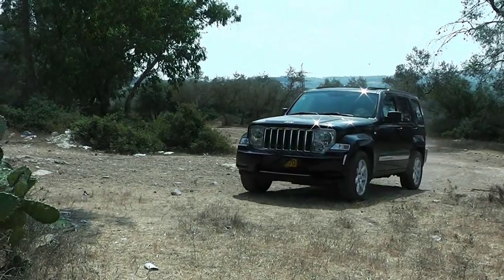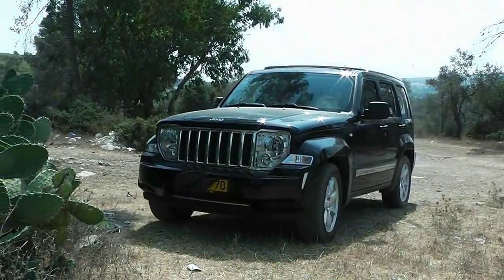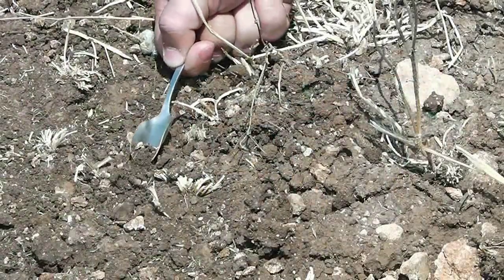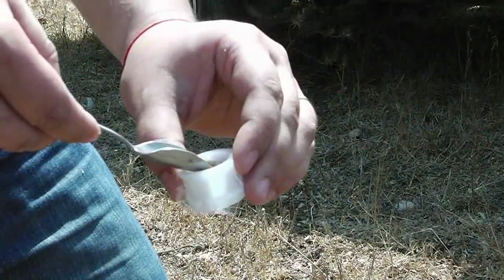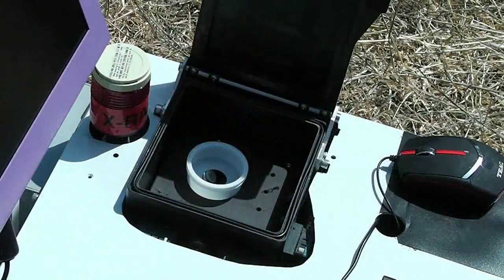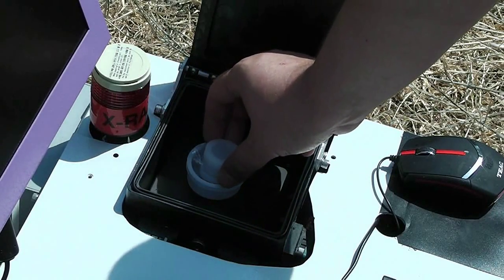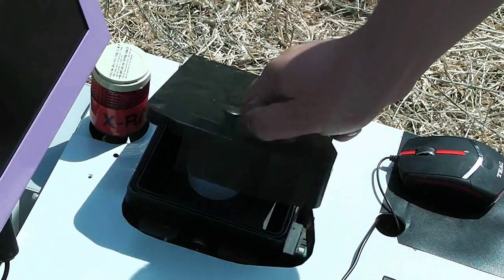The S-Mobile is a compact spectrometer that can be taken to the job site without any compromise in analytical abilities. When the task calls for fast, real-time, high-quality results, the S-Mobile perfectly meets the job description.